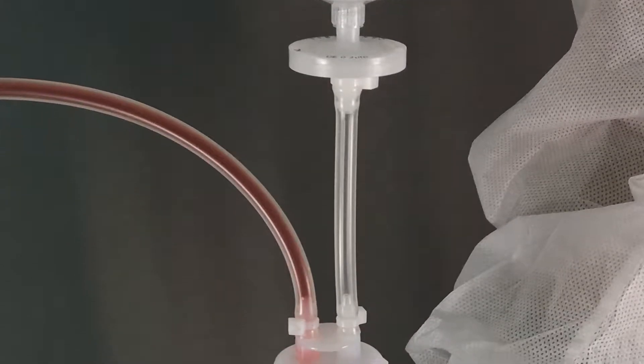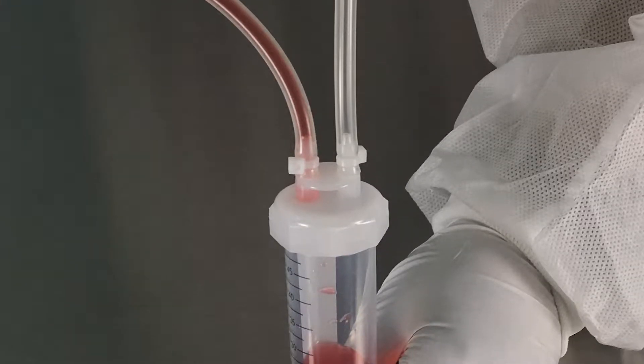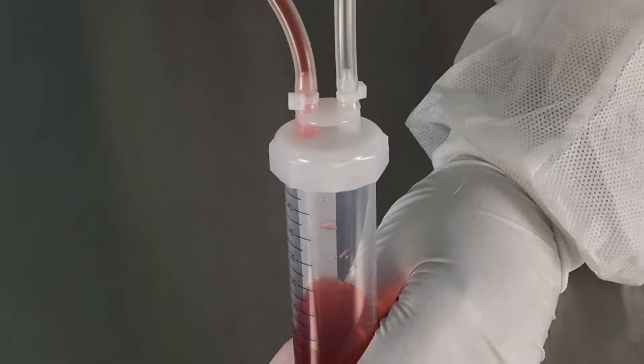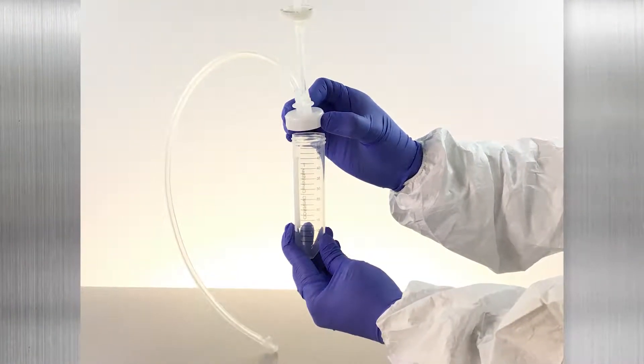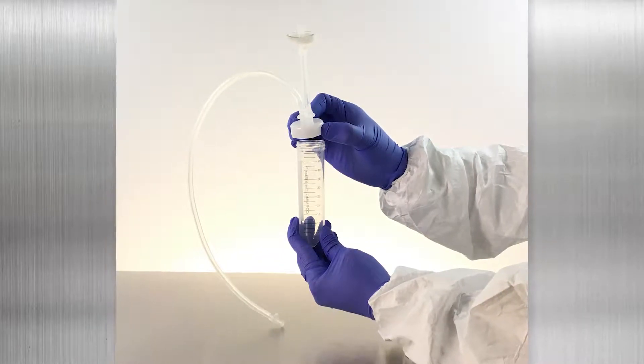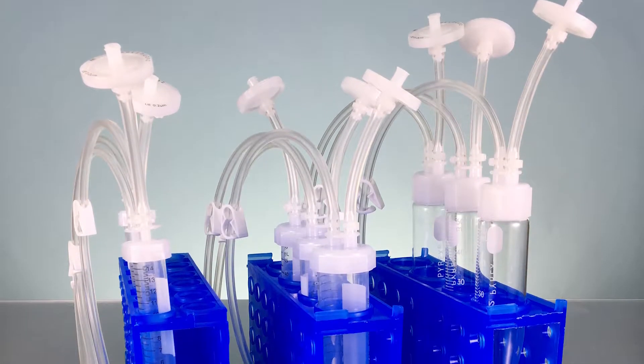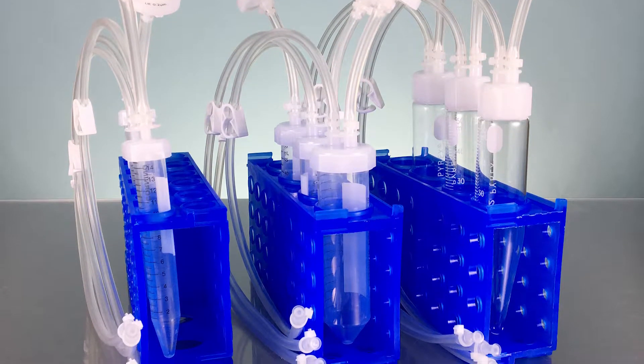VWR single-use Omnitop sample tubes are a first-in-class bioprocessing sampling system for performing sterile sampling and small fluid transfer. All standard Omnitop assemblies are built with 18 inches of thermoplastic tubing to create welds for sterile connections. Multiple standard configurations are available in both 15 or 50 mL sample tube sizes.